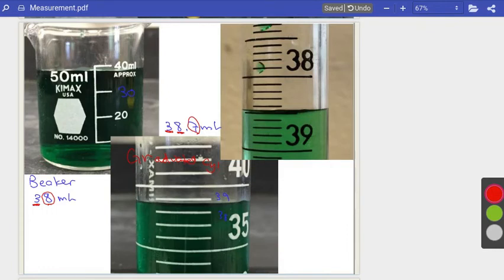Last but not least, we have our burette. This is a piece of glassware that's in that to deliver category. So notice that the numbers are getting bigger as you go down the piece of glassware. So that's a little different. And then also notice that the big numbers are already the ones place. The increments, these little guys right here, those are tenths places, which is fantastic.